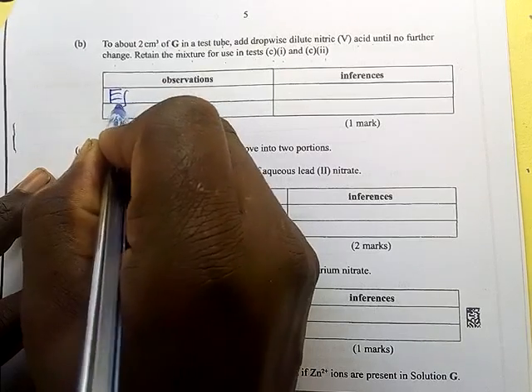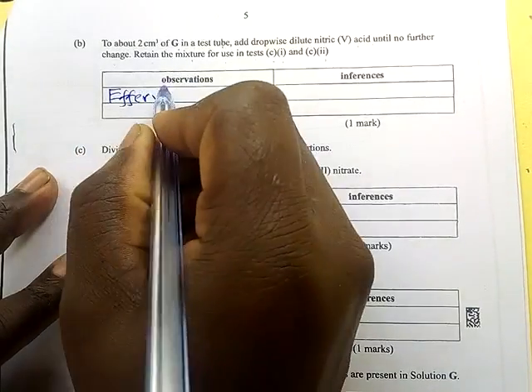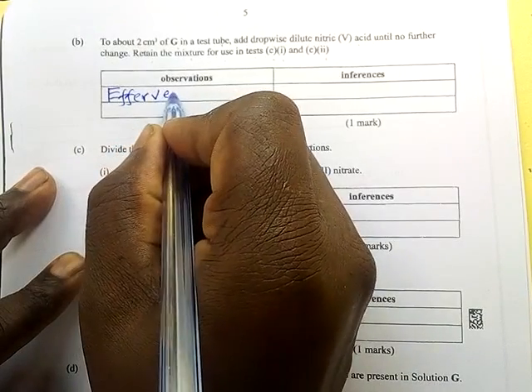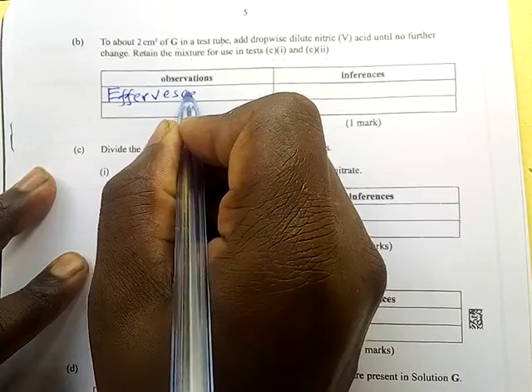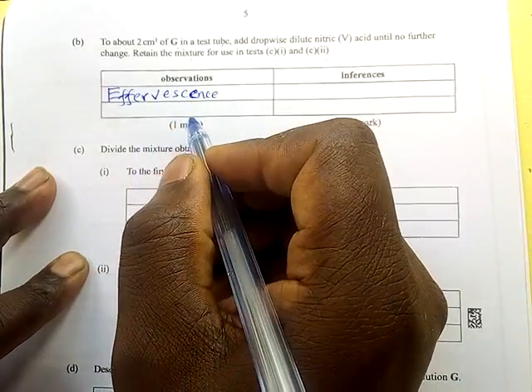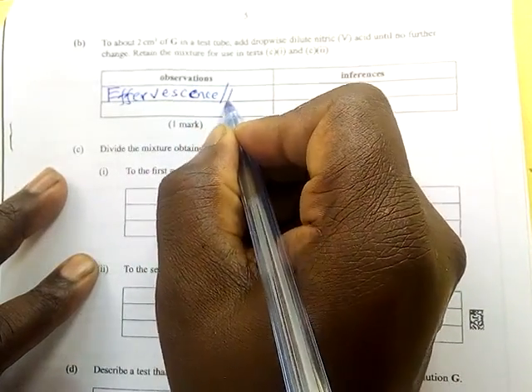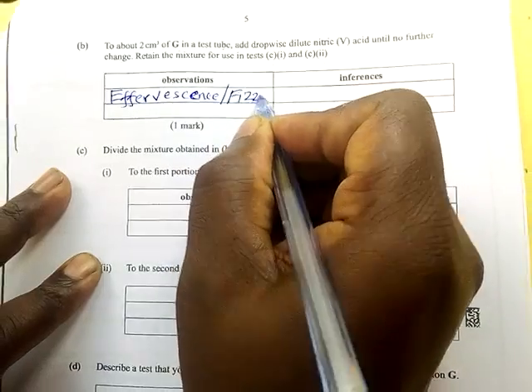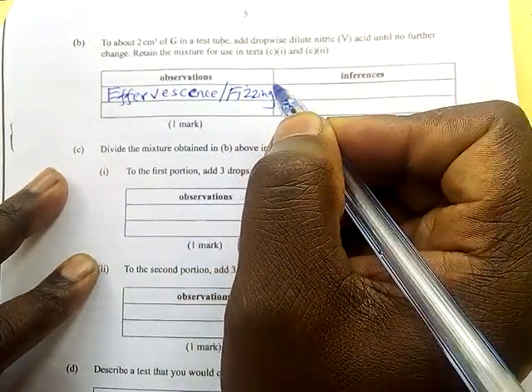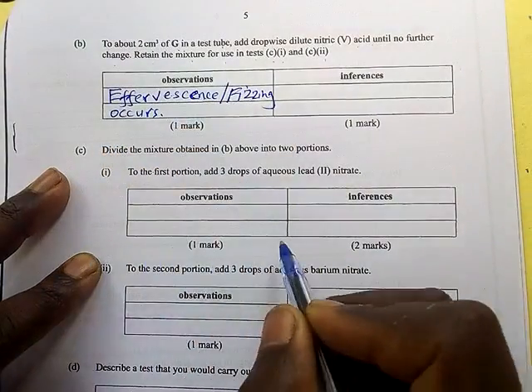So effervescence, it will either occur or it will not. For this one, effervescence occurred. Effervescence occurs. If you don't write effervescence, you can write fizzing. Fizzing occurs. So effervescence occurs.